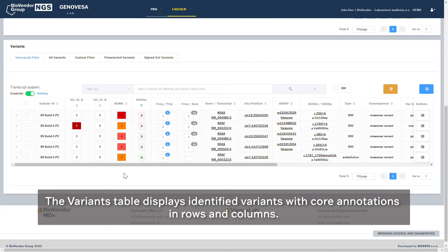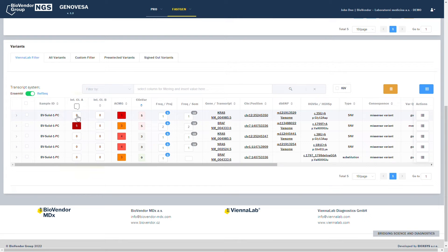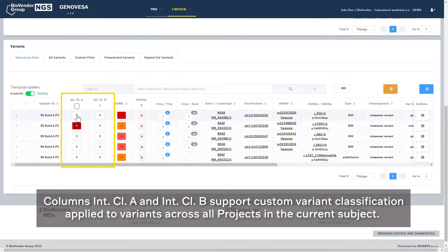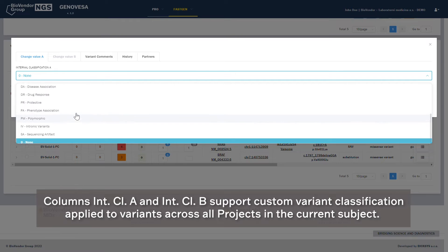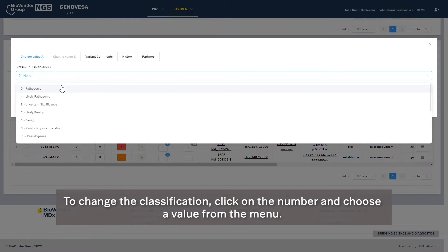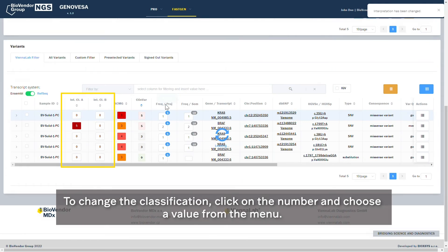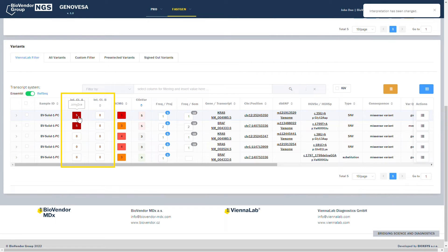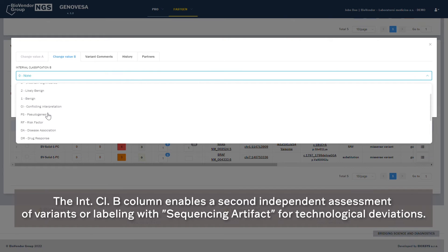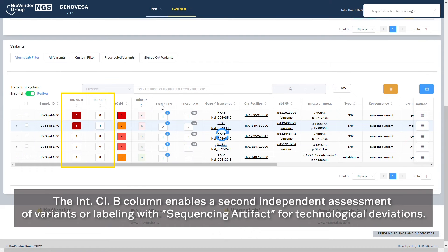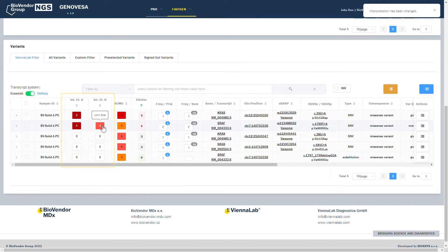The Variants table displays identified variants with core annotations in rows and columns. Columns Internal Classification A and Internal Classification B support custom variant classification applied to variants across all projects in the current subject. To change the classification, click on the number and choose a value from the menu. The Internal Classification B column enables a second independent assessment of variants, or labeling with sequencing artifact for technological deviations.